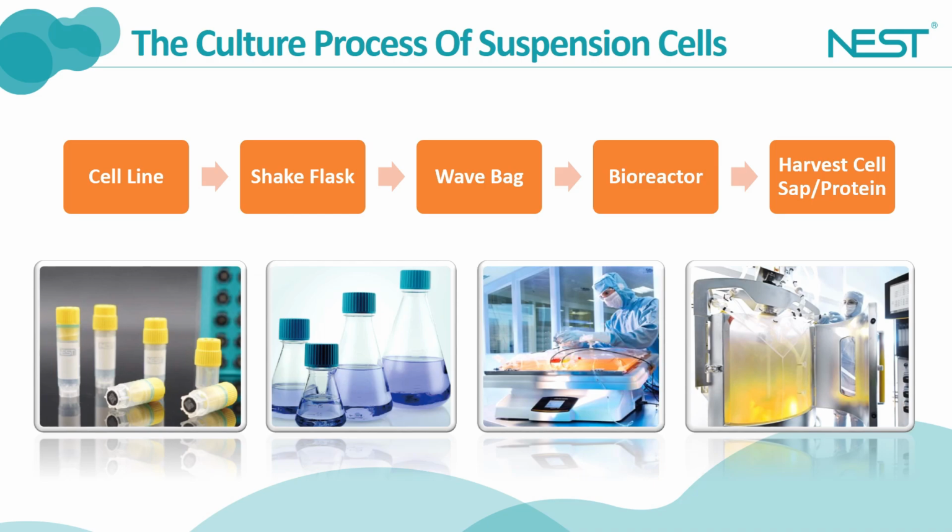At the stage of shake flask culture, the optimum culture conditions are obtained via exploration, and the cells receive further culture expansion. The maximum volume of NEST shake flask is 5 liters, and then the culture will be transferred to a wave bag and bioreactor gradually. The circular rotation of shake flask and the wave movement of wave bags both aim for better gas exchange and to prevent cell precipitation at the bottom.